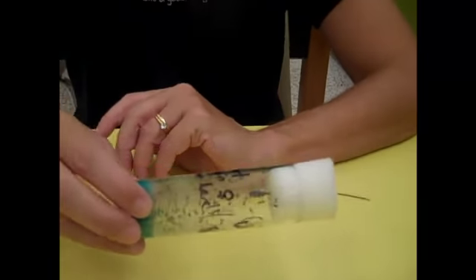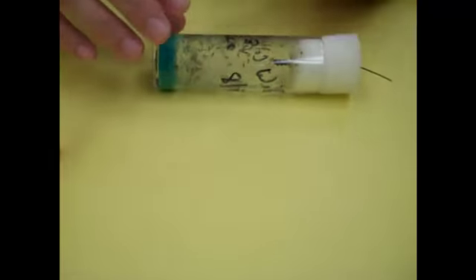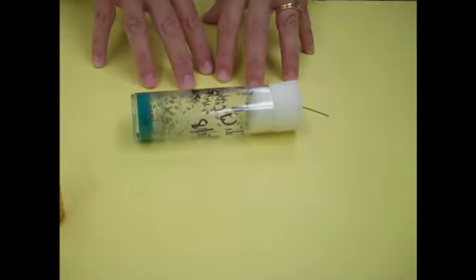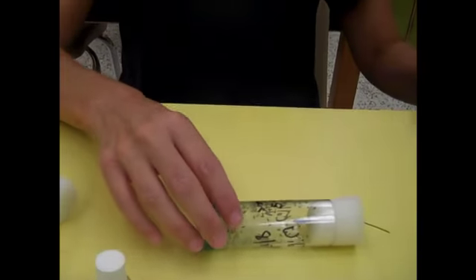Now, what you want to do is lay the vial down on its side, because if you keep it upright, they're going to fall down into the blue goo when they fall asleep, and they'll die in that goo. So what we're going to do is let them fall asleep with the vial sitting on its side, because that way they'll fall onto the plastic in the vial and we can get them out much more easily.